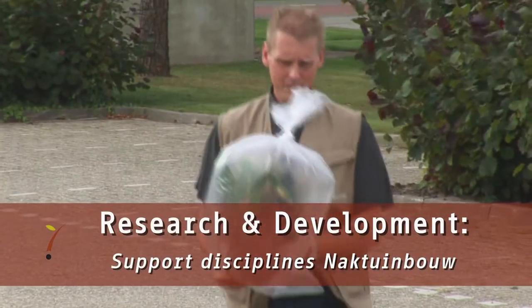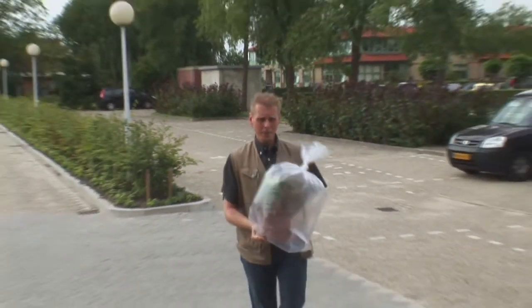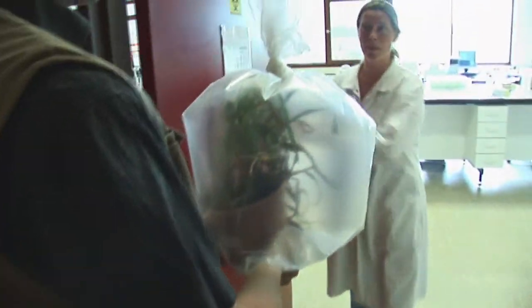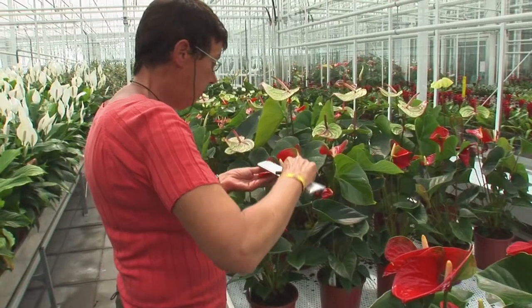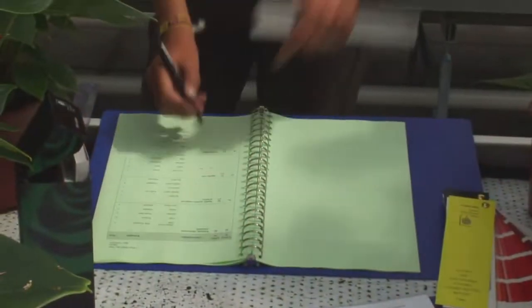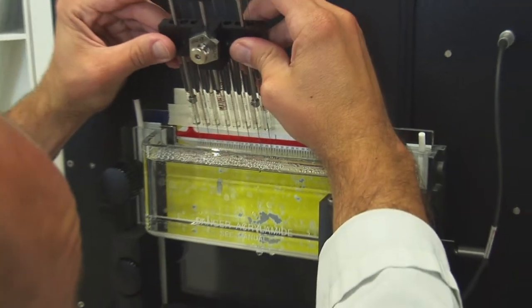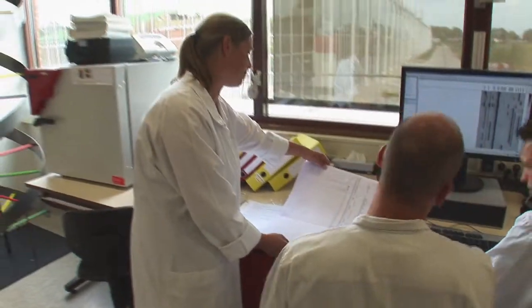As well as developing and improving tests, the team also supports the other disciplines at Naktuinbouw. For instance, the inspection department can be assisted by providing background information about new pathogens. To support variety testing, R&D can determine the kinship of new and existing varieties at the DNA level. This information is used to select the most closely related varieties for comparison purposes during variety testing. But DNA testing can also be used to reveal infringements of plant breeders' rights and to clear up mistaken identity of plant varieties.